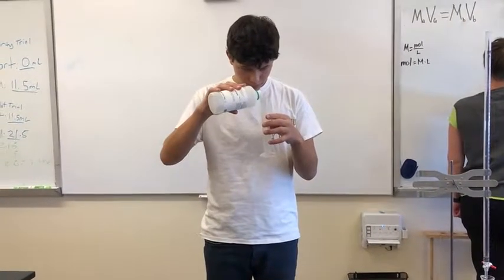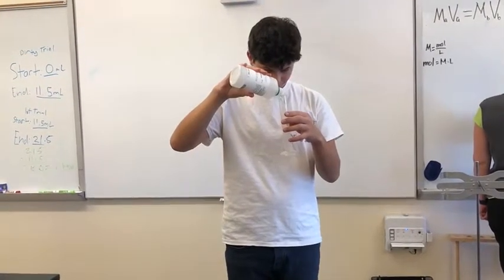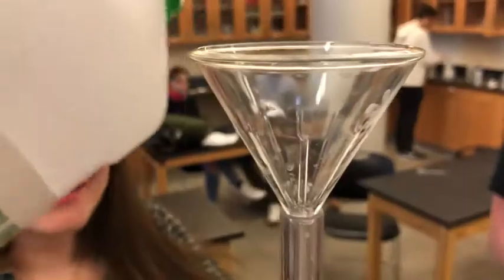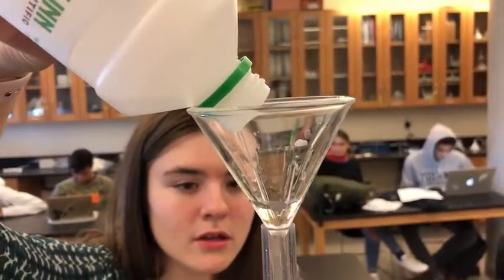Step 1. Rinse the inside of a clean burette thoroughly with water. Step 2. Make sure the outside of the burette is clean and dry, and then mount it securely to a laboratory ring stand using a burette clamp of the proper size. Step 3. Fill the burette to above the zero mark with a base using a funnel.